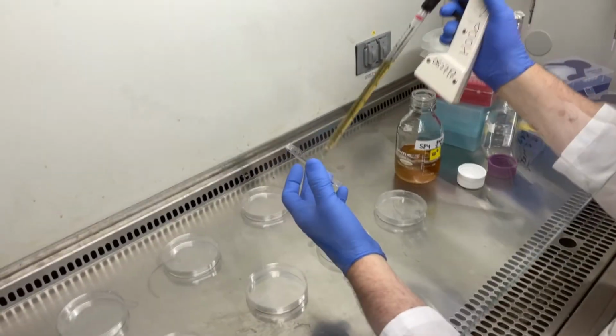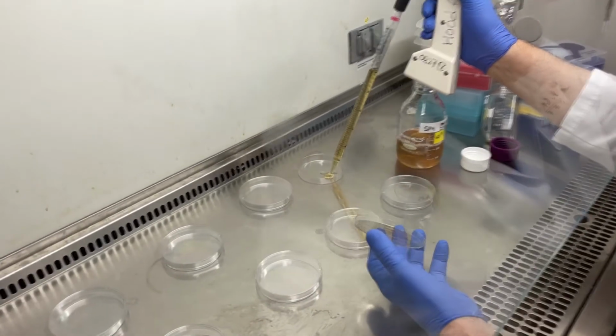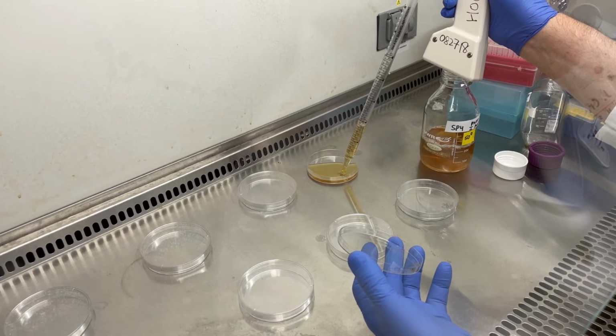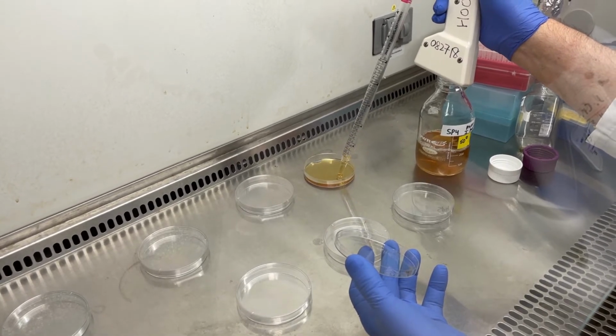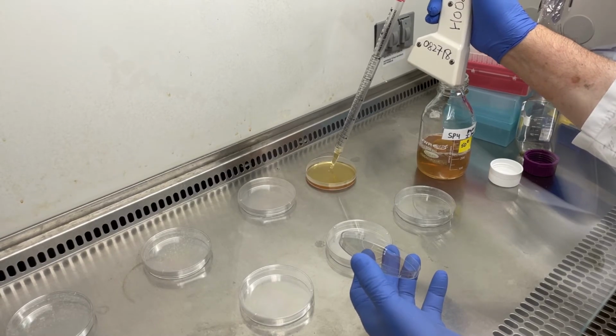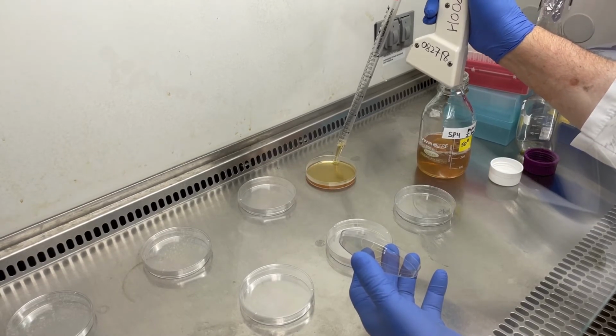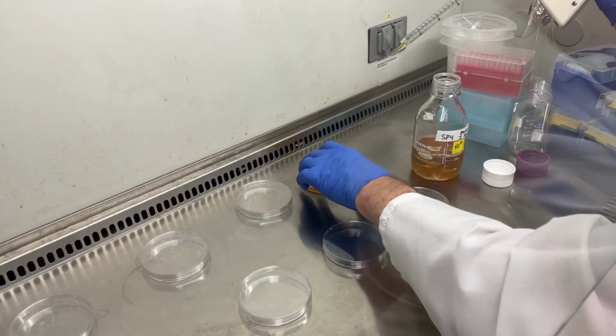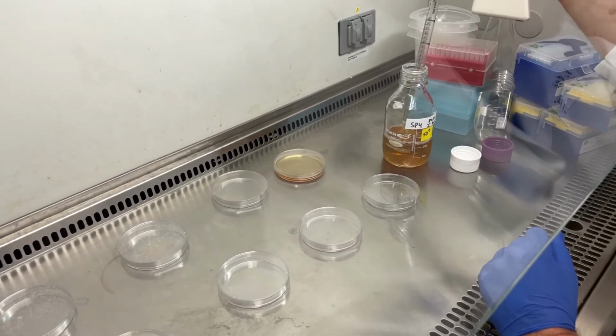You can very carefully put the tip, without bubbles in the tip if possible, and gently deliver this to the Petri dish. We do not expunge all the fluid. We leave fluid in the pipette to avoid the many bubbles at the meniscus in the pipette.